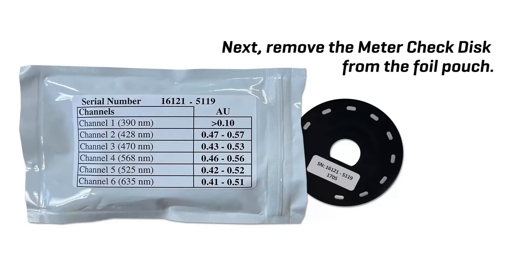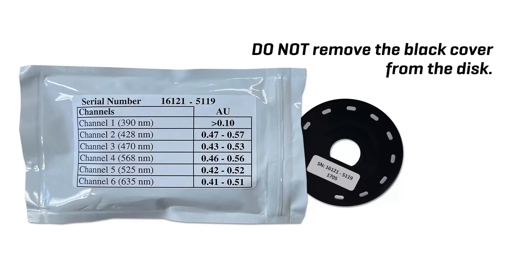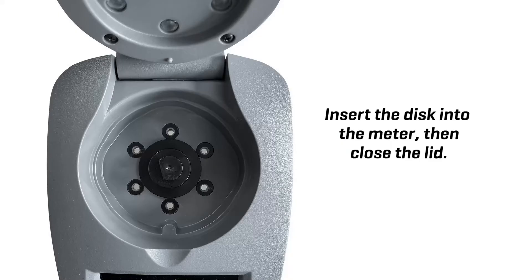Next, remove the meter check disk from the foil pouch. Do not remove the black cover from the disk. Insert the disk into the meter, then close the lid.